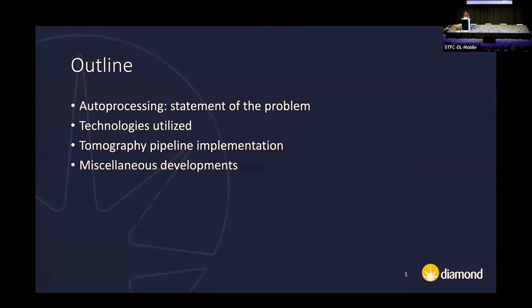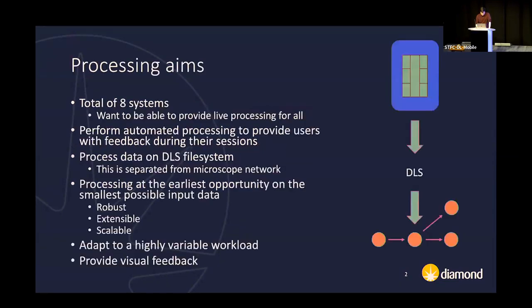That's an early stage tomography pipeline that should get users to rough tomograms on the fly as their data collection is going on. And then at the end, I'll just discuss some miscellaneous but connected developments. So the statement of the problem.